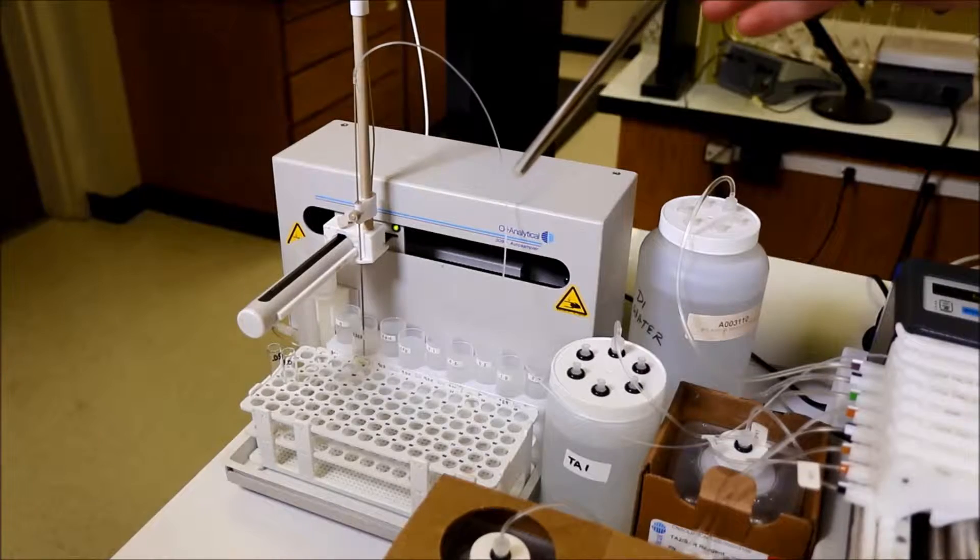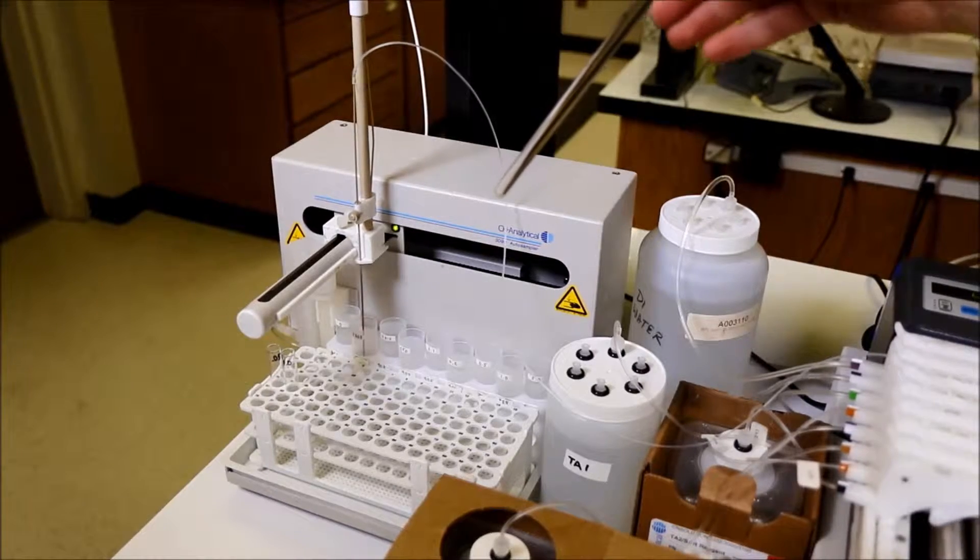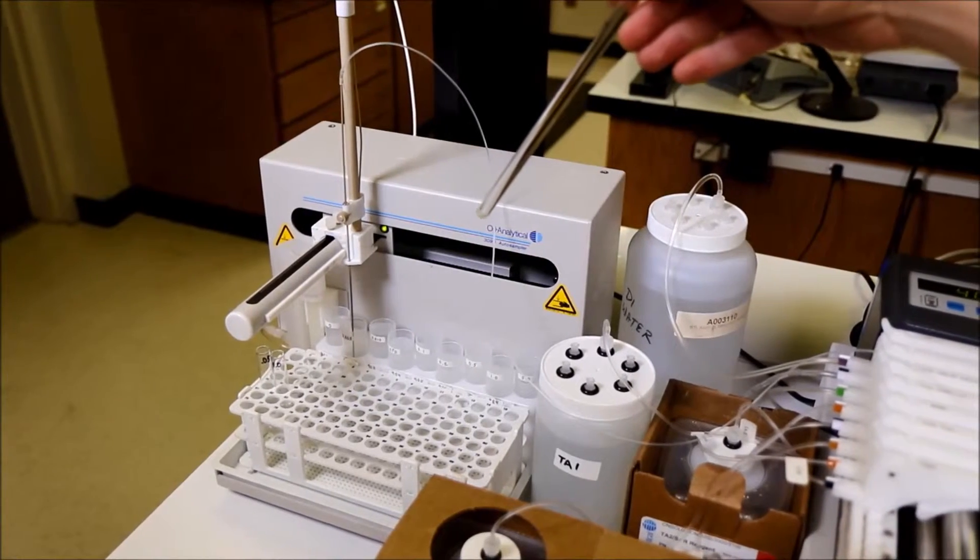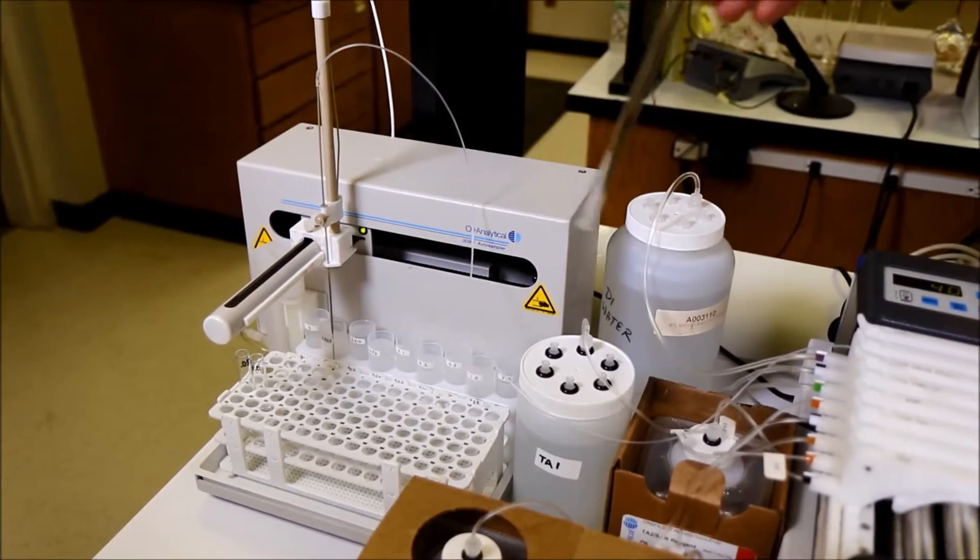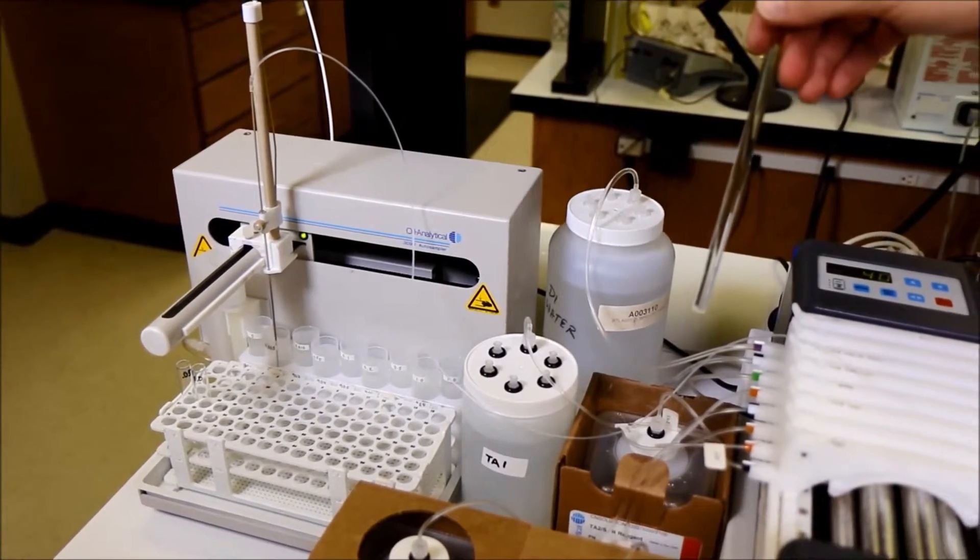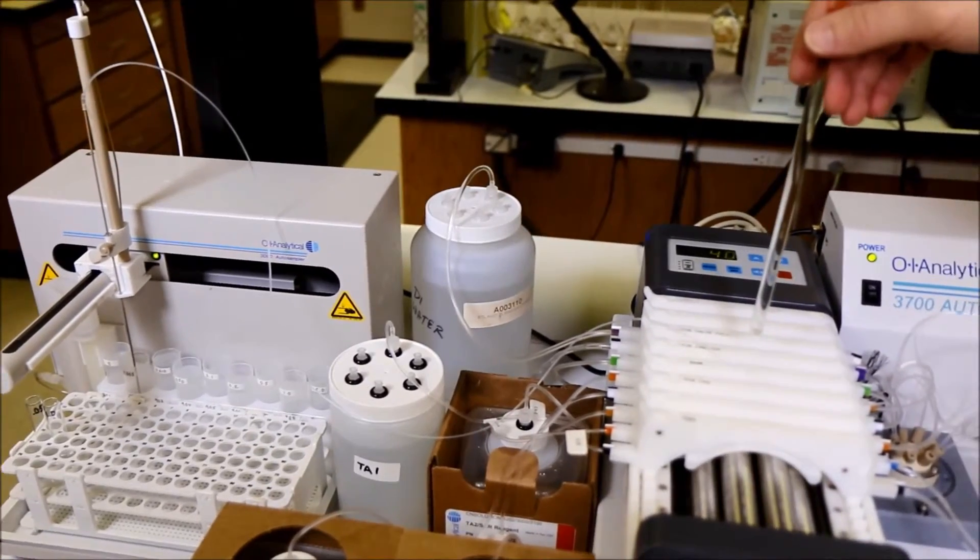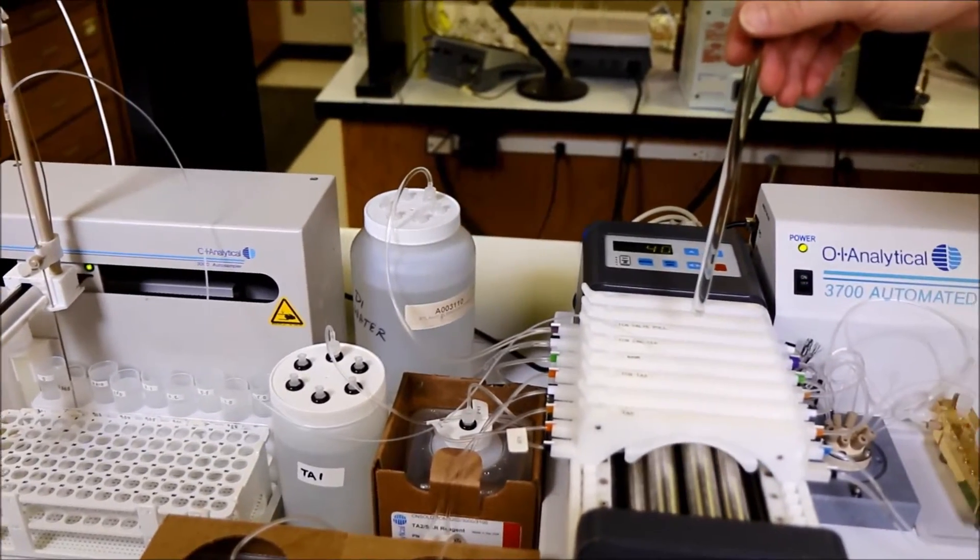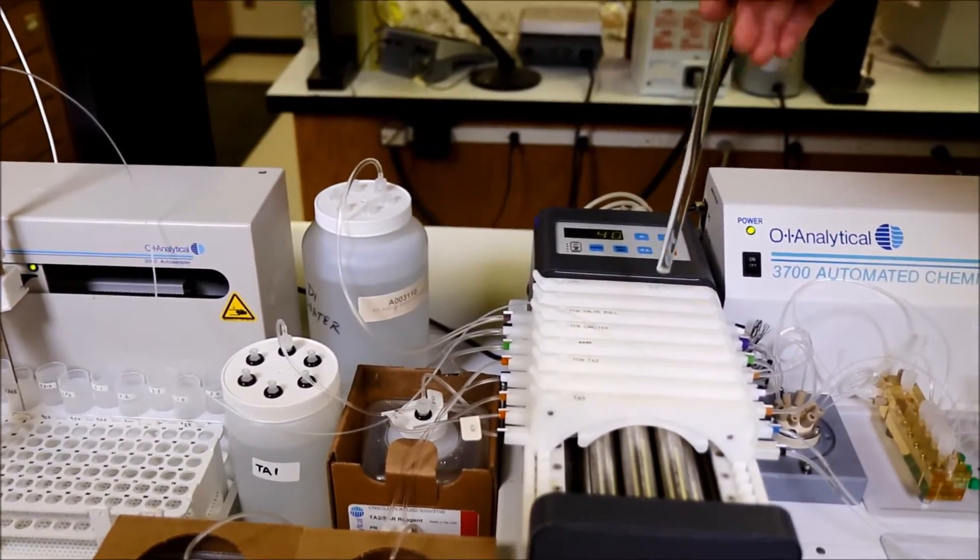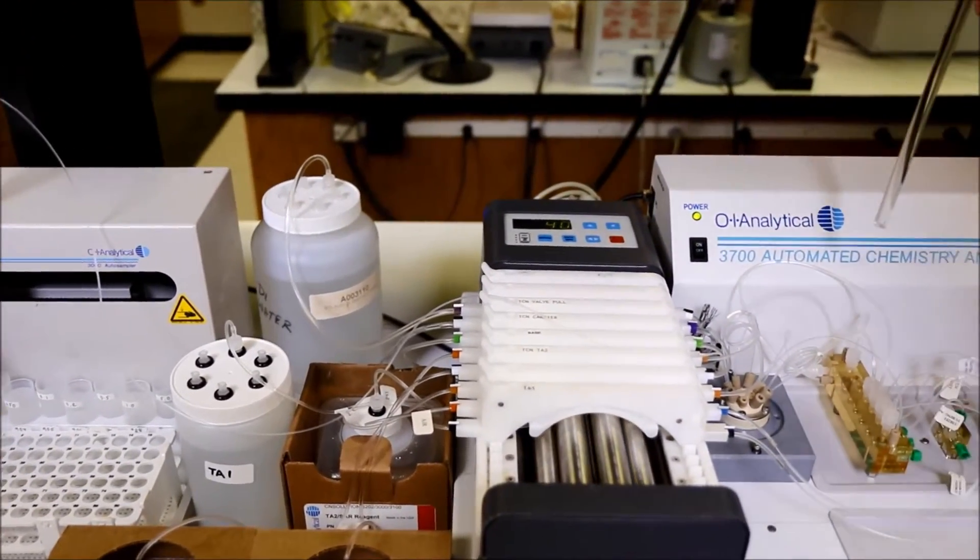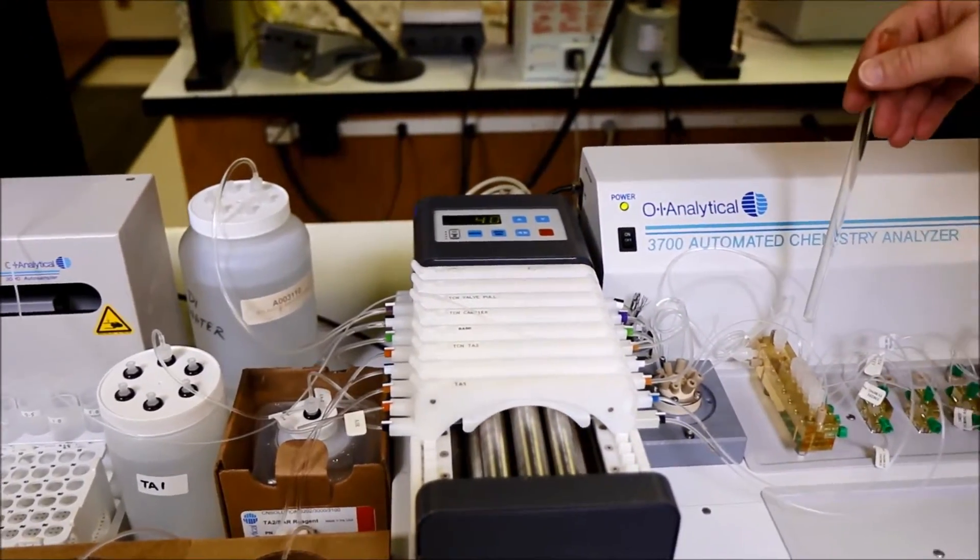Samples are introduced utilizing an auto-sampler and, along with the reagents, passed across a peristaltic pump and over to the distribution manifold.